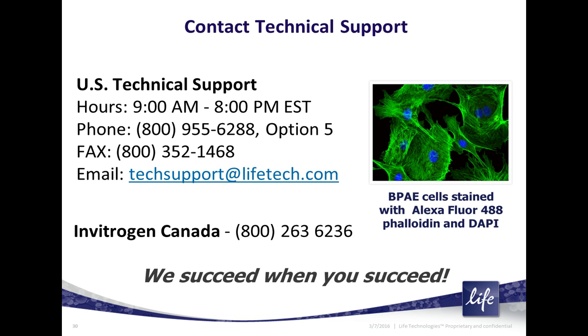Is it possible to incubate with different antibodies simultaneously, or should it be done separately? Well, as long as your primary antibodies are of different species, or at least of different isotypes, then you can do them together.